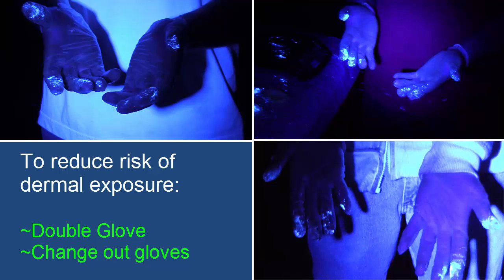A precautionary approach is to double glove, especially when using thinner gloves or when handling large quantities of powders. Gloves should also be changed out regularly.